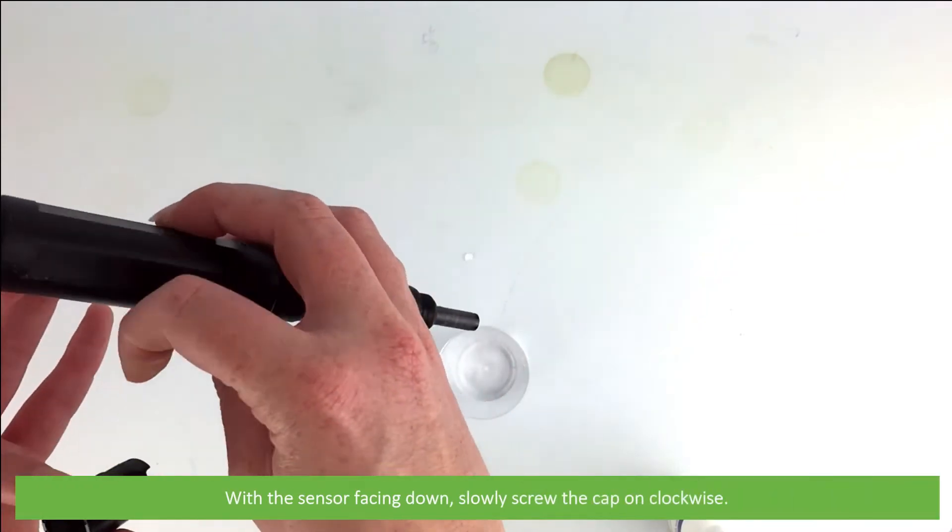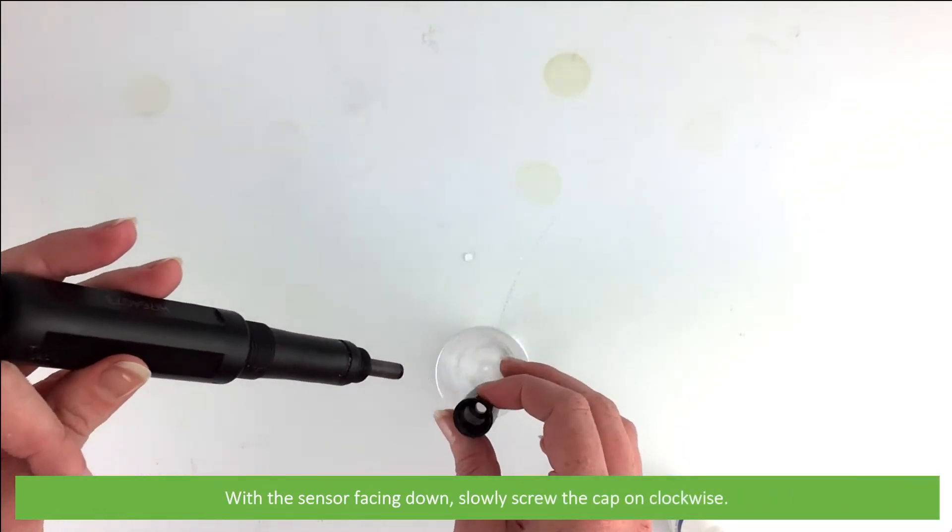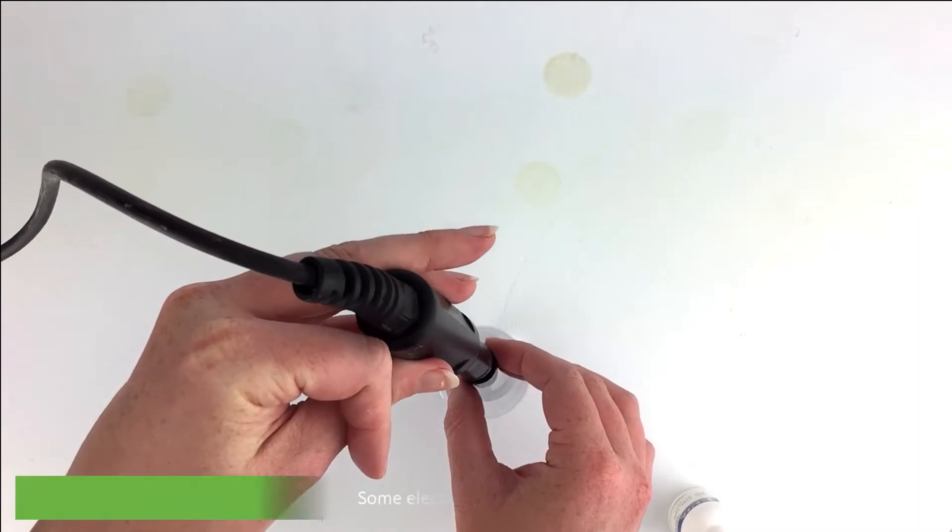With the sensor facing down, slowly screw the cap on clockwise. Some electrolyte will overflow.